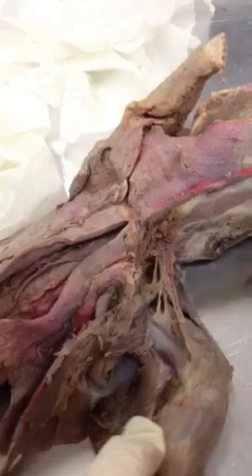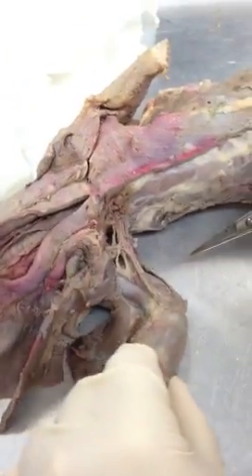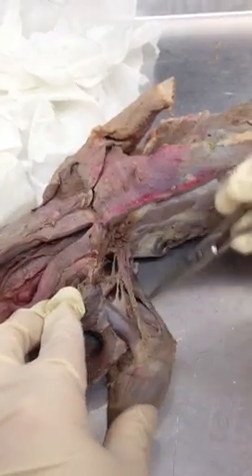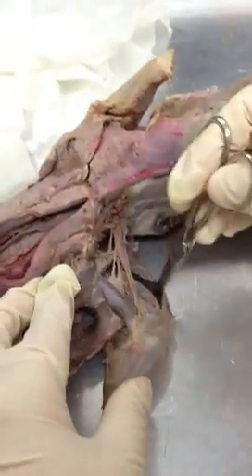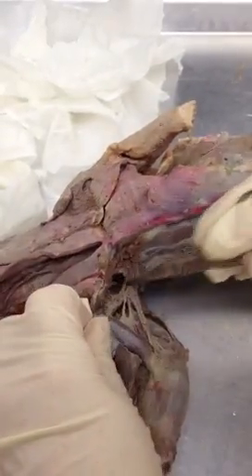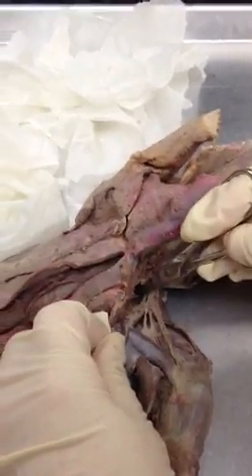So first, right in here — imagine I'm doing a little flex for us — that's biceps brachii. Right here, medial head of the triceps. Long head of the triceps. Everybody's favorite muscle, dorsal epitrochlearis. Now, in my mink, hard to see it because I want to keep these nerves intact. Way underneath there, that's subscapularis.